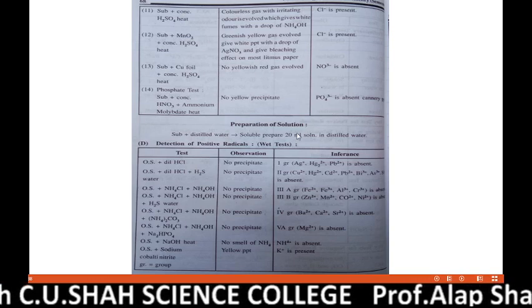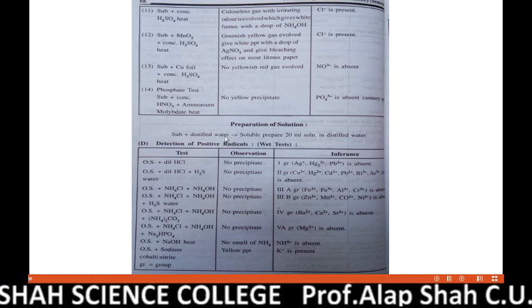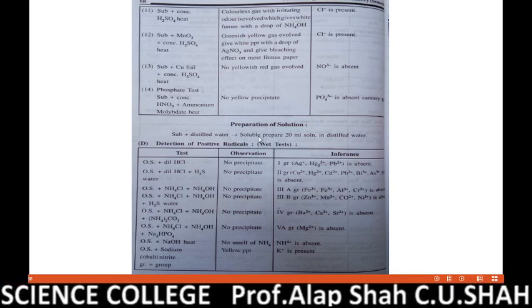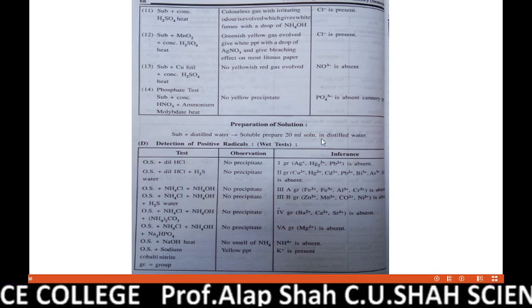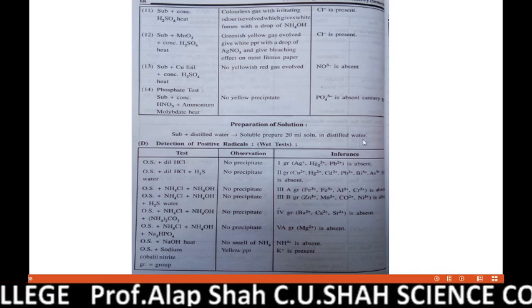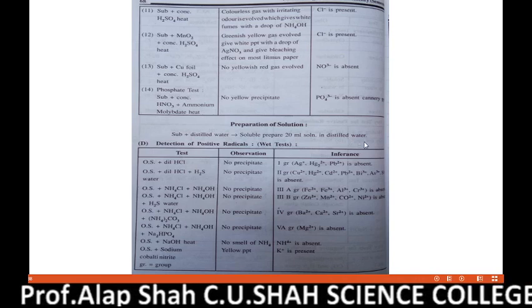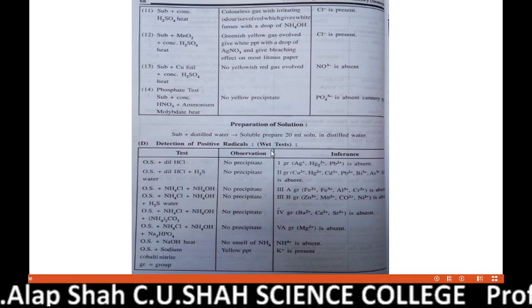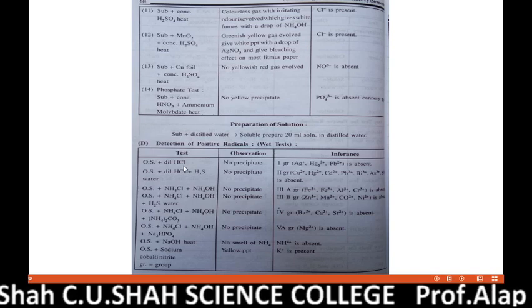Preparation of solution. Since our compound is water soluble, obviously we will prepare the OS in distilled water, and after dissolving it we heat the solution. We do not boil it, but it should be heated. So up to here, the primary dry tests of positive, negative, and preparation of solution were new for you, but once the OS is prepared, the wet tests are a repetition of 12th standard.